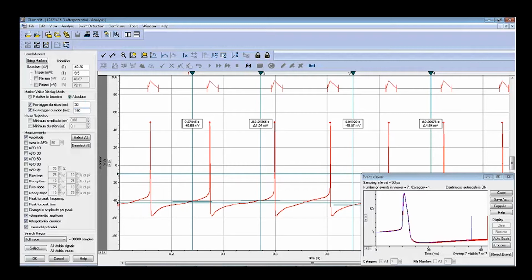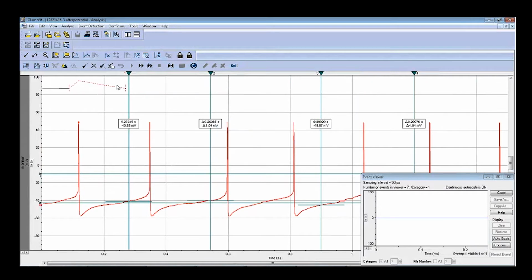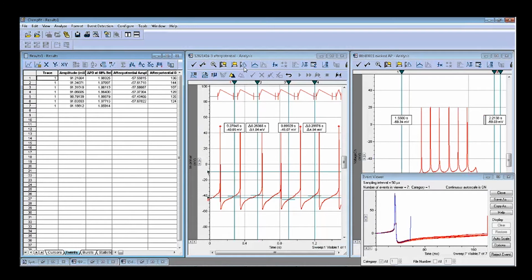I'm glad that I show you, right? Because you can see here the event is shorter than the duration here. So now I increase the post-trigger duration. Now you can see here, hit OK, and we start it. And now when you run it, you can see the data result. Now, that is what I want, right?